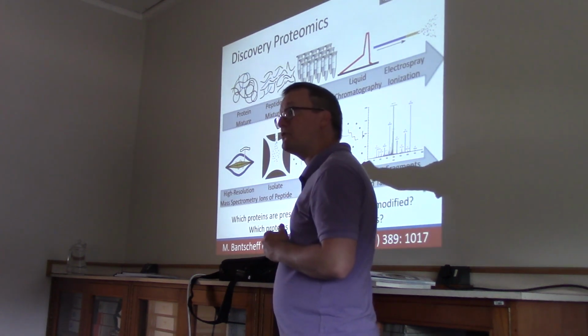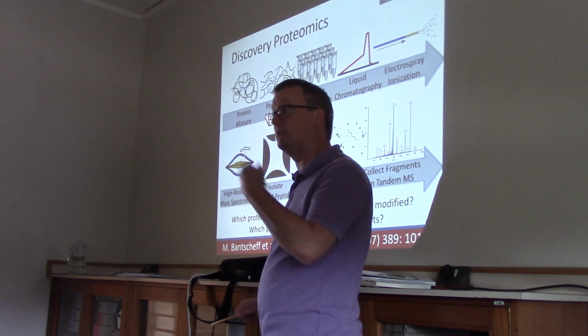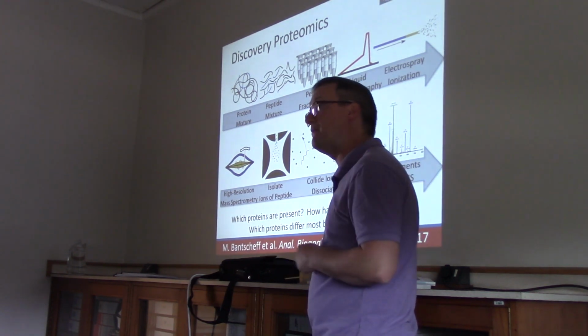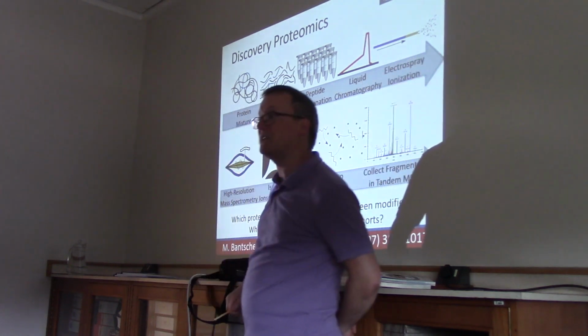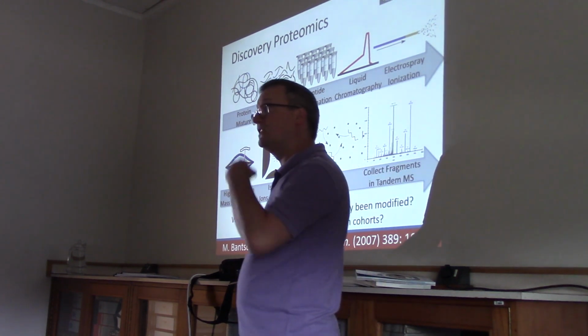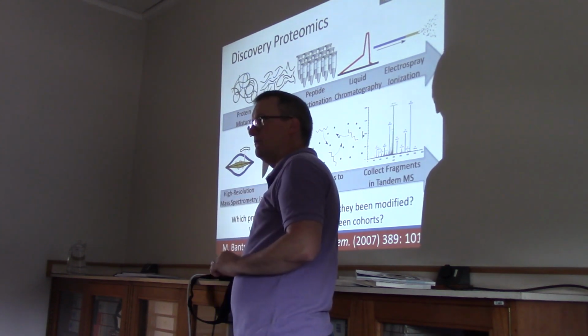So having created a bunch of fragments for many, many copies of a particular peptide, we then analyze the mass-to-charge ratios of the fragments produced from that peptide. So the mass spectra tell us which peptide ions were available to break at this point in time. The tandem mass spectrum shows us the list of fragments that were created when we blew apart a particular peptide.